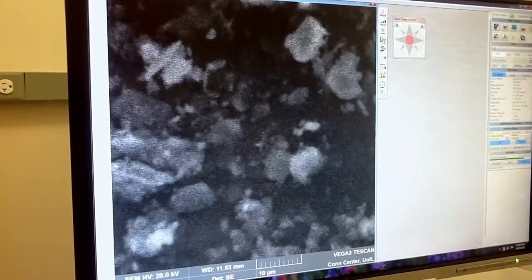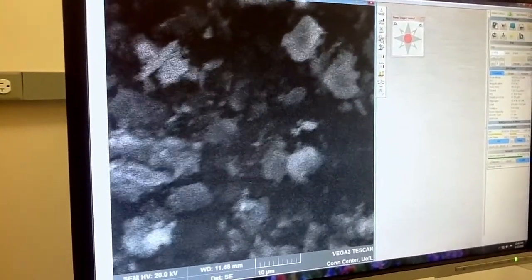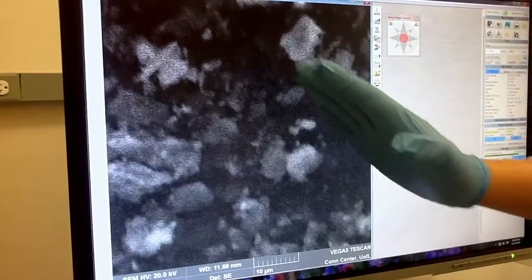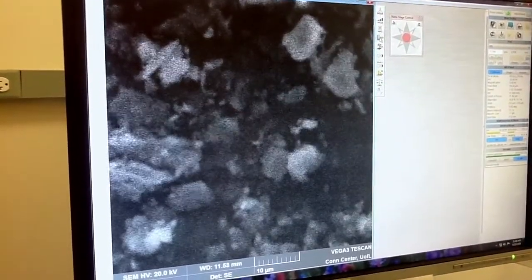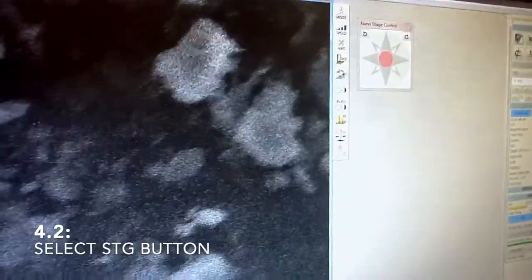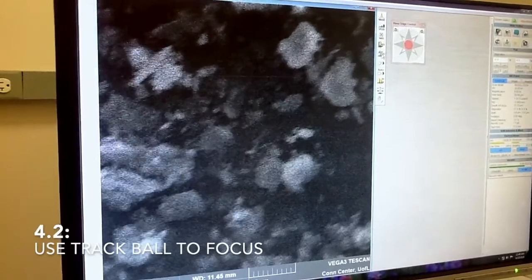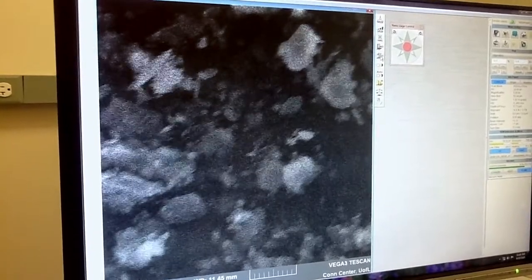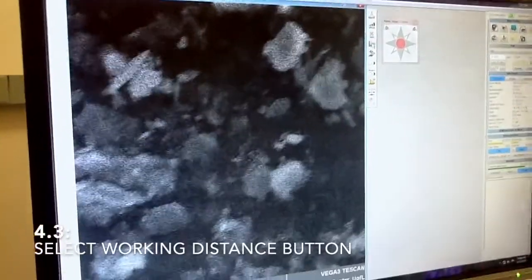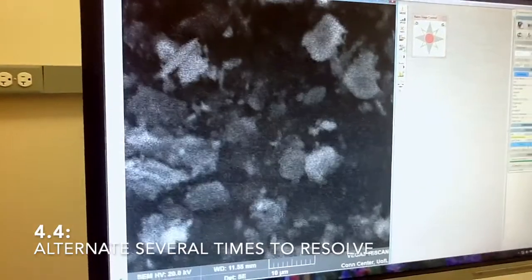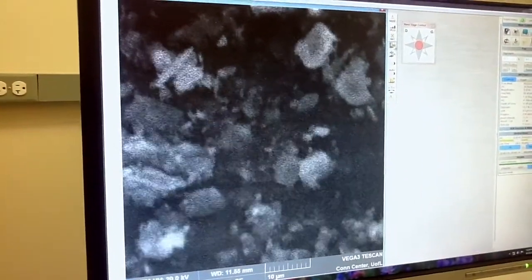When you move the trackball around the focal point you will see elongation in one direction if under-focused, or in the perpendicular direction if over-focused. This is an indication of astigmatism. To correct for this, just use the stigmator. Go to stigma, refocus, go to stigma again, refocus — and do this iteratively until the astigmatism is corrected.